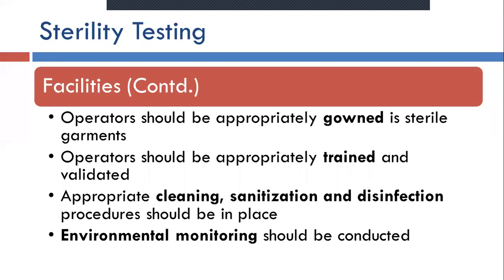So the training of the personnel who are conducting this test is very, very important, because one should know the consequence of the results. If any false results are given, what are the consequences? They should know, and they should be properly trained. And appropriate cleaning, sanitation, and disinfection procedures should be in place, and they should be documented.